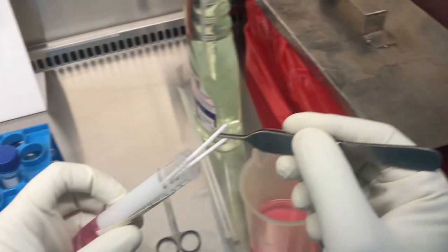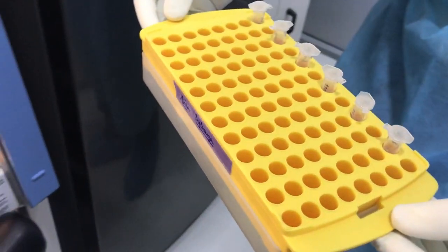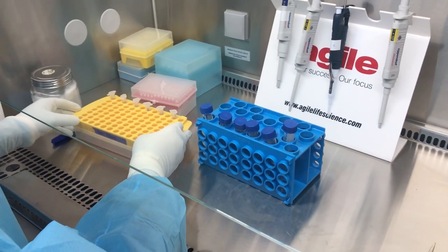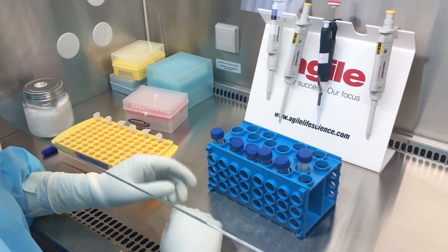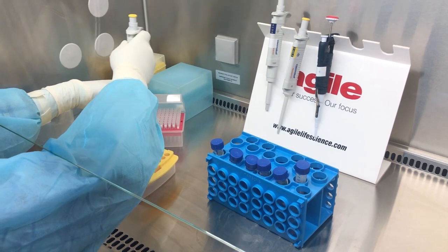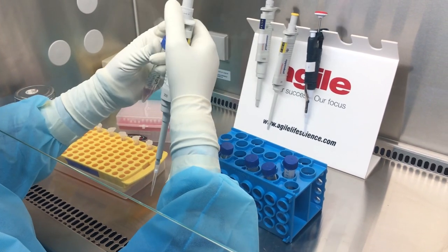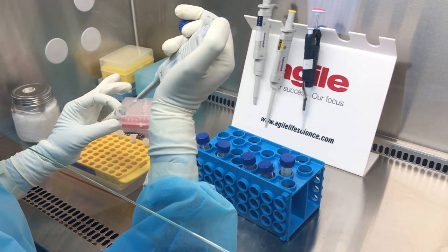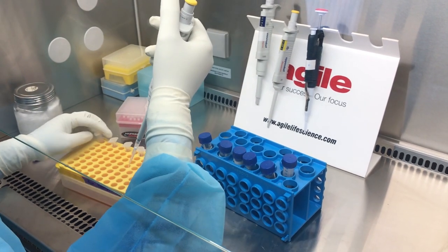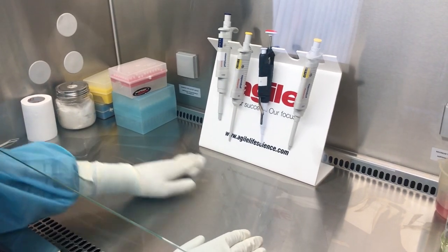Discard the swabs from the respective tubes in a discarding pan containing disinfectant. Aliquot the desired volume of the respective sample into the respective lysis buffer tube. After completion, the lysis buffer containing samples are sent to the RNA extraction team. And clean the biosafety cabinet.